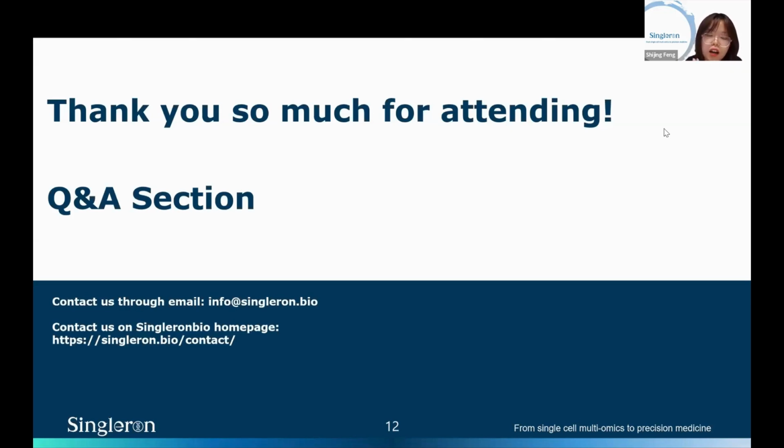And you have, for example, 4 donors, and I would recommend you do two combined libraries, and for each combined multiplexing, you should have 4 samples from different donors. And in the meanwhile, I would suggest you include 2 samples from the treatment naive group and 2 samples from the after treatment group, to also minimize the batch effects between the groups.